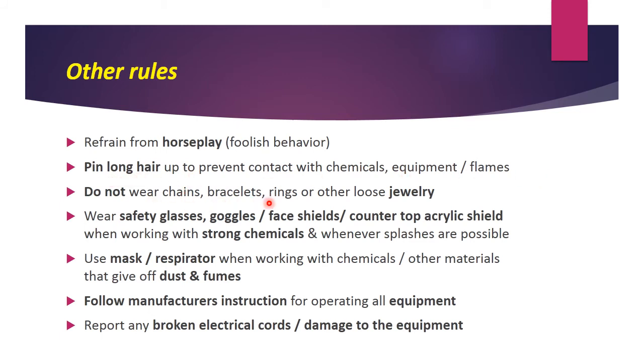Do not wear chains, bracelets, rings or other loose jewelry. If these costly metal things come in contact with strong chemicals, they may change their properties. So please avoid using all this jewelry.